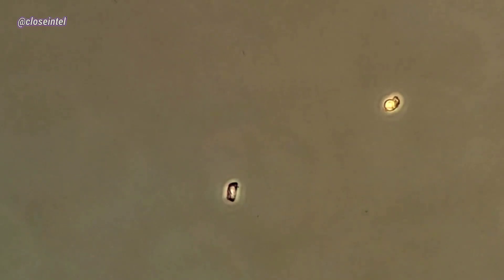After looking through a few different samples all that I came across was some debris but no microbes or any signs of life. Using the gas pump as a way to extract the water is probably what caused most of the debris but it was the only way I could think to do this experiment without contaminating it too much.